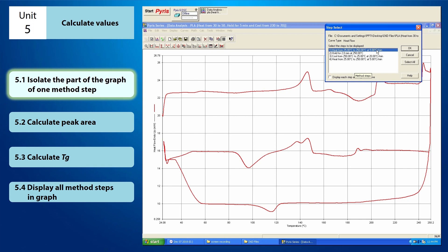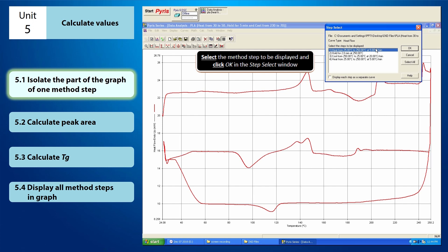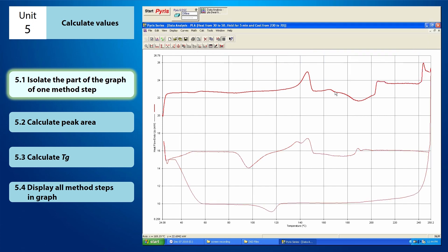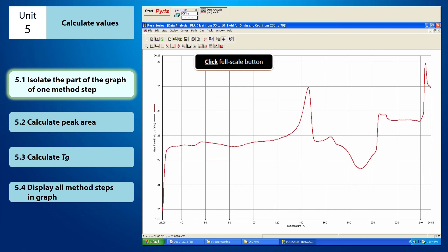From here, you can see the list of steps within the graph. Select the method step that you want to isolate and click OK. As you can see, the part that you want to isolate will be in a darker color. Then click Full Scale from the shortcut buttons to focus on the isolated part of the graph.